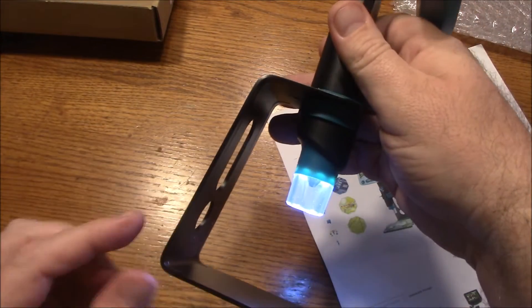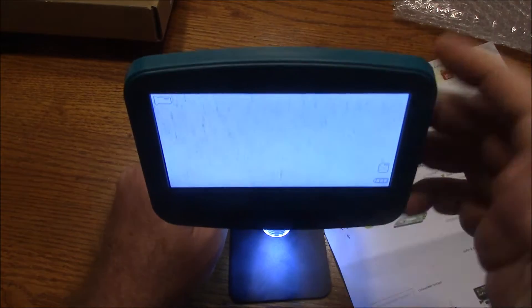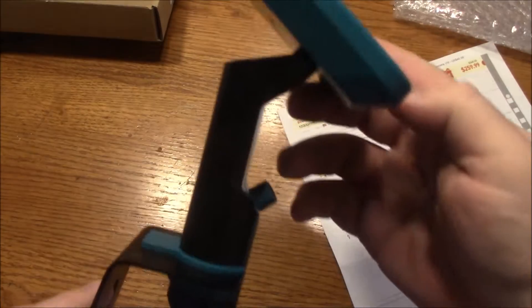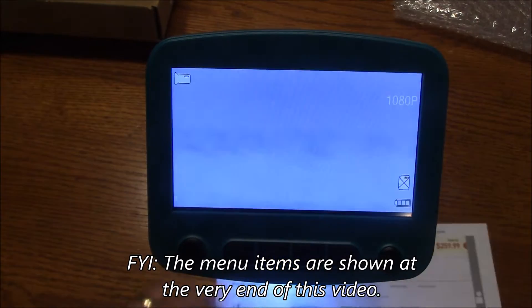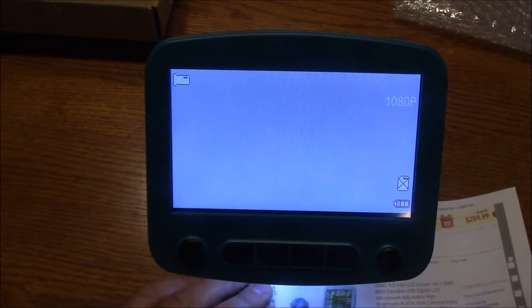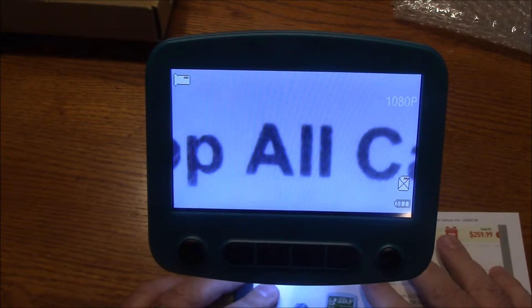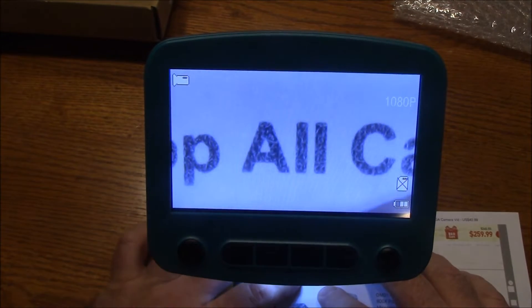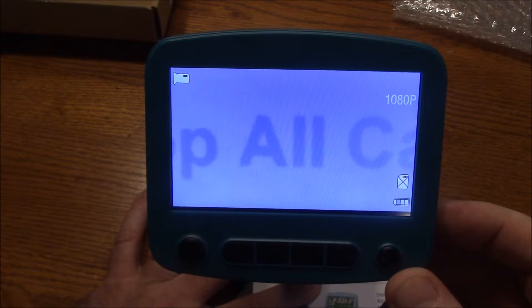Alright, so it's working. This slides into this little holder, and this is just the holder that it came with. There's actually another one that has a wheel on the side that will adjust it up and down. The cool thing about this is it has a little adjustable screen, and when you're using a screen to look at stuff, it's kind of cool because more than one person can see it at the same time, rather than like an eyepiece where you're only getting one at a time. It's real nice and bright. I can adjust the brightness here, make it a little bit dimmer or a little bit brighter.